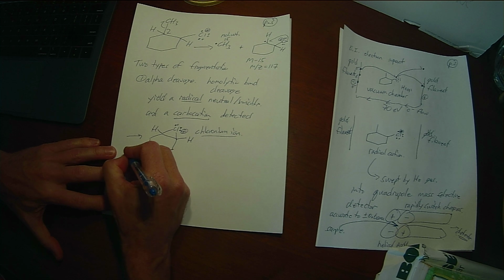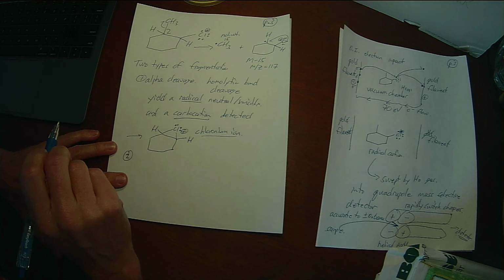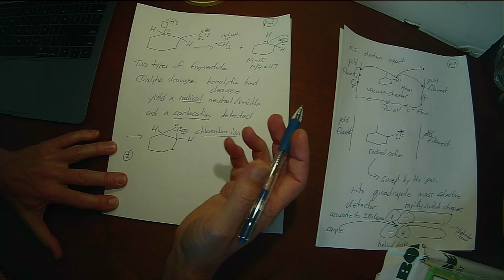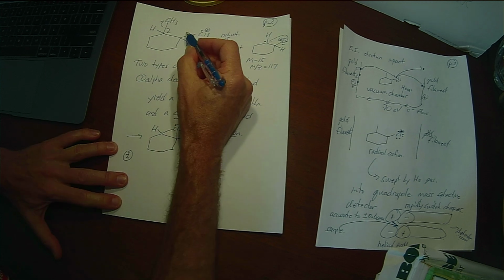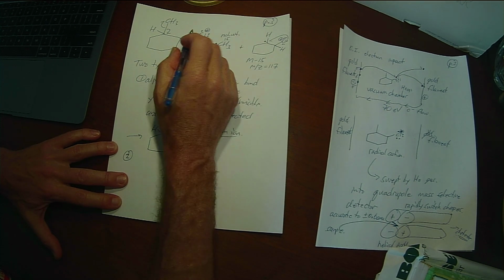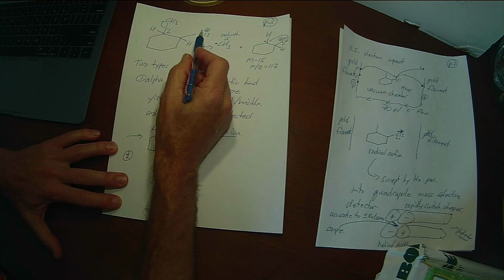And because chlorine is polarizable, loss of chlorine is a fairly common fragmentation, and that's the one you saw, I think, in figure 5 in the lab manual, where the chlorine actually took its electrons with it to form a carbocation and a chlorine radical.